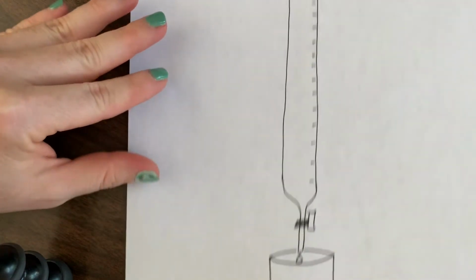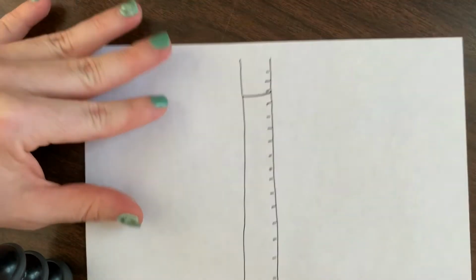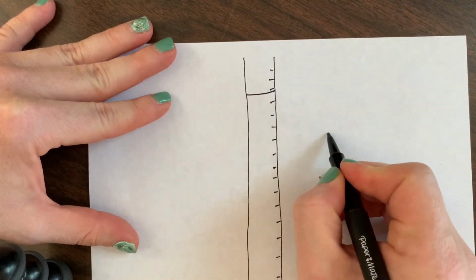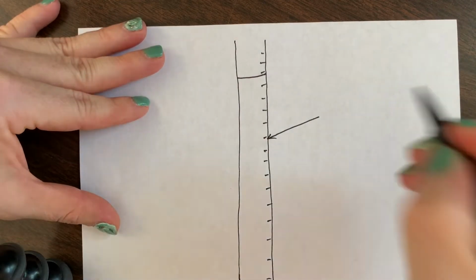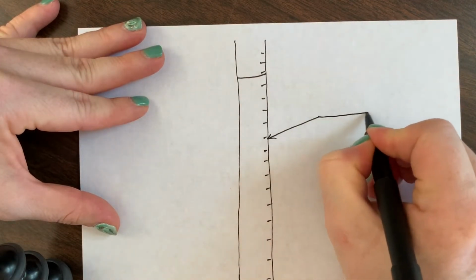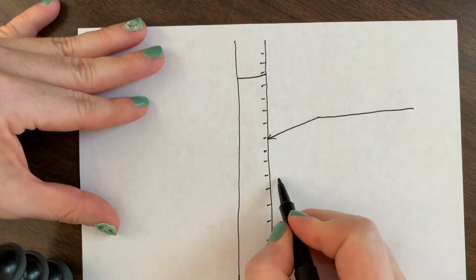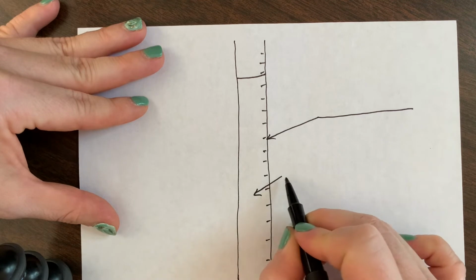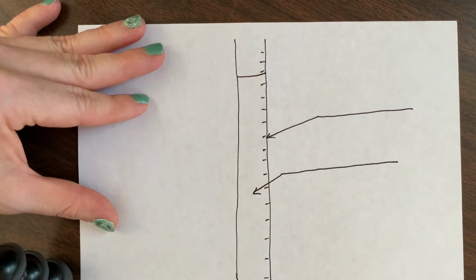So, let's label it. Now we've got a liquid level right here. So this piece of glassware is associated with this arrow and this blank space for you to label. Now this arrow represents the liquid inside this piece of glassware.